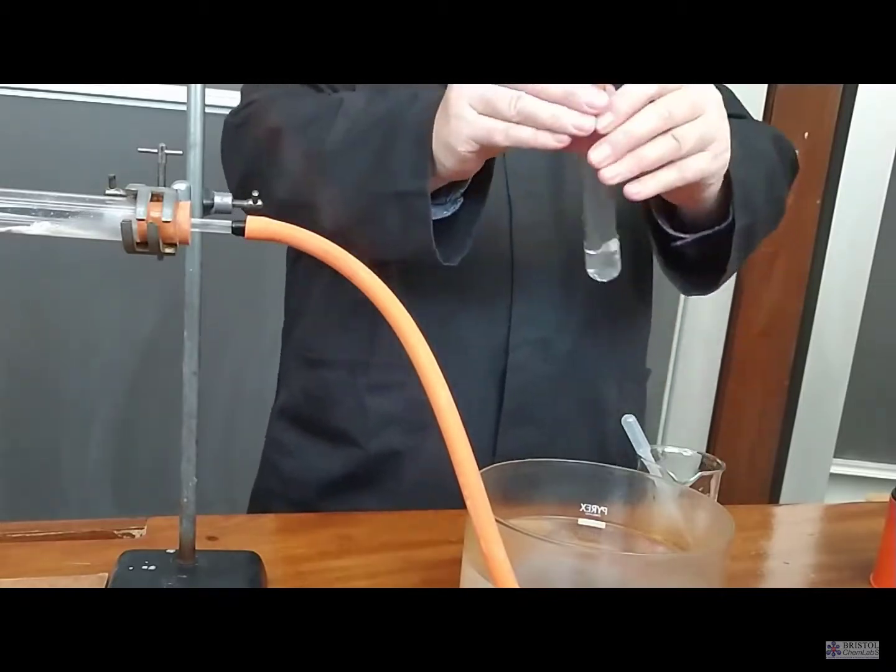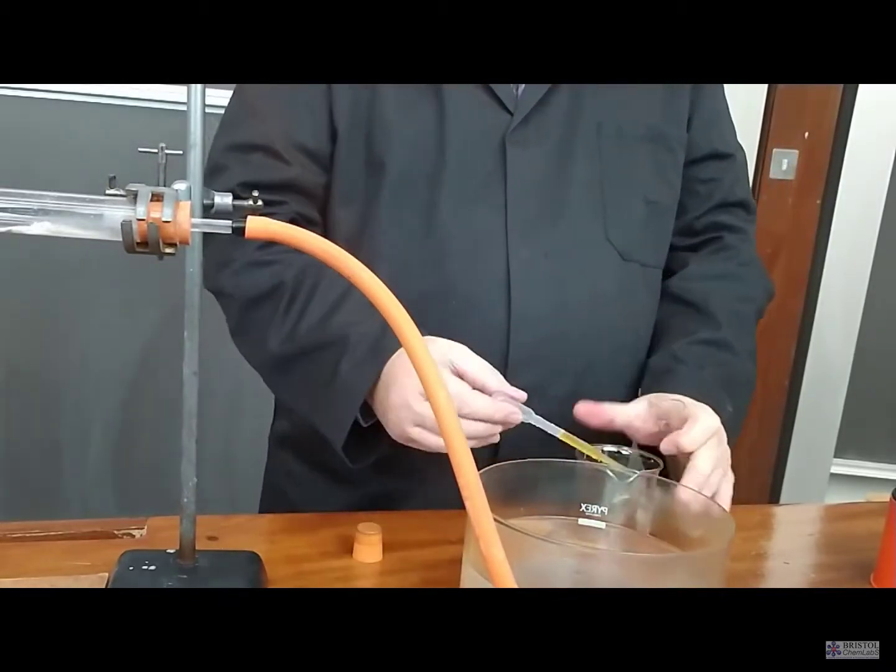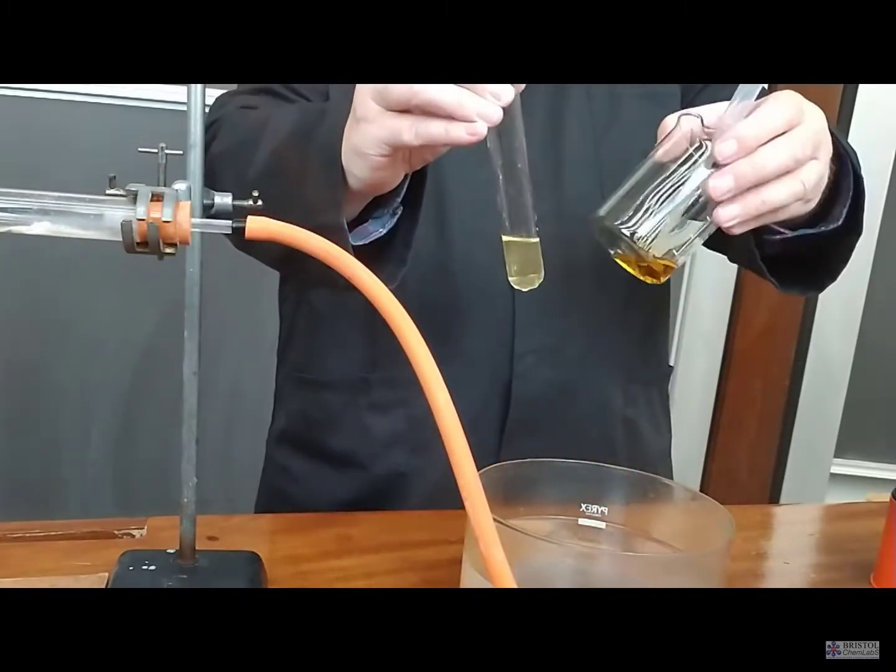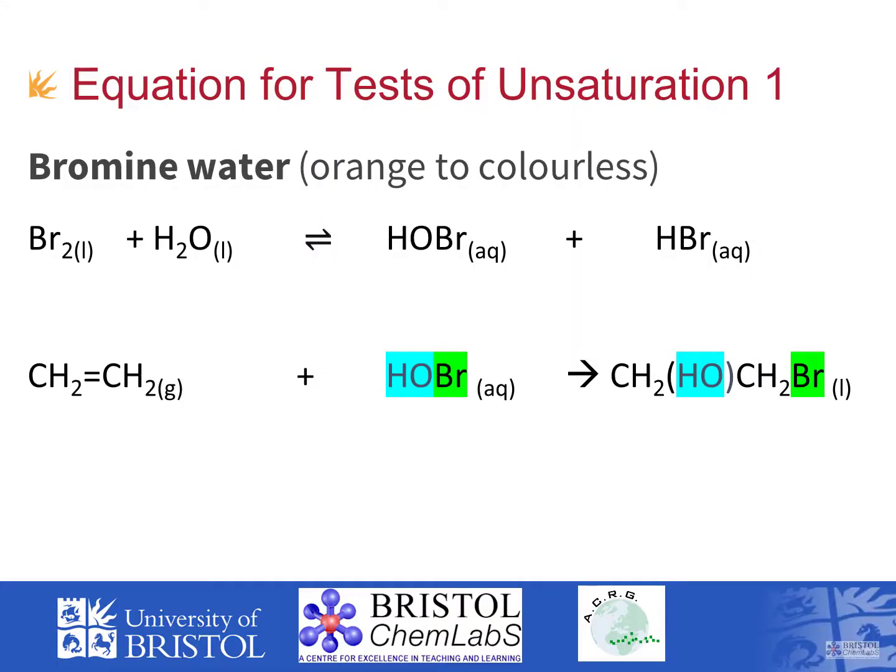The bromine water should be very dilute, and you should just add a few drops of bromine. Now here we're using a boiling tube of the gas, so we can add a few squirts. And with shaking, you should see that we've got a colour change from orange to colourless.